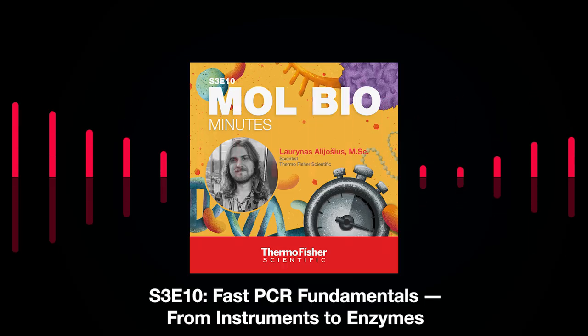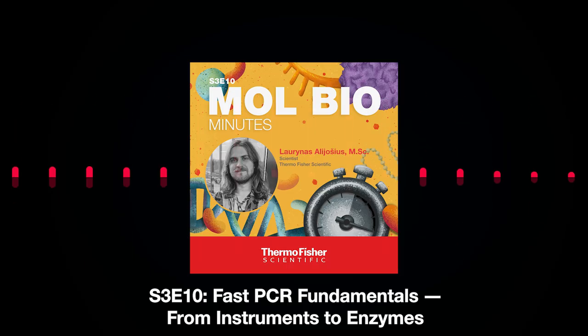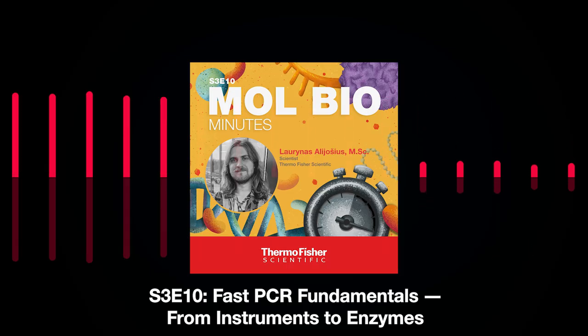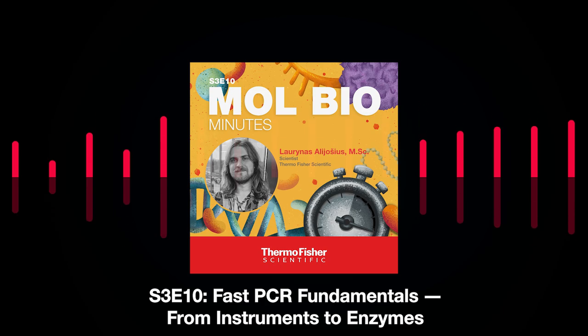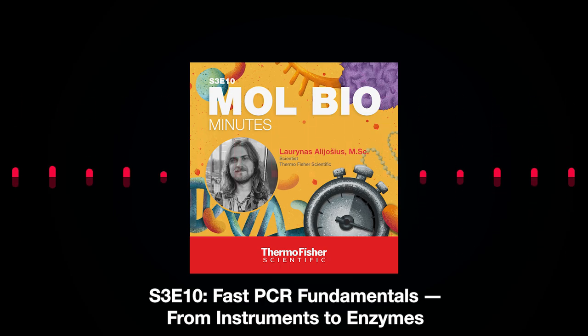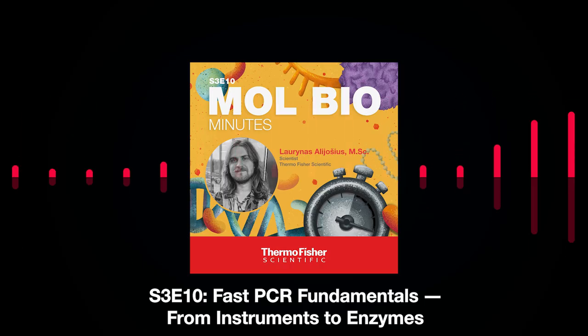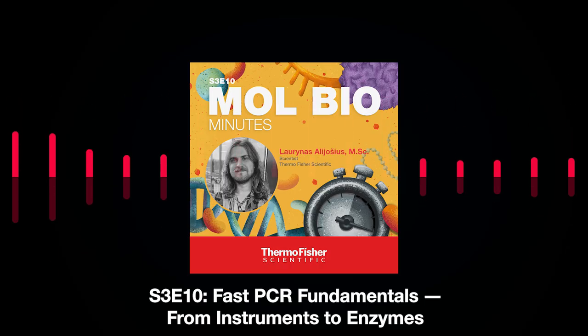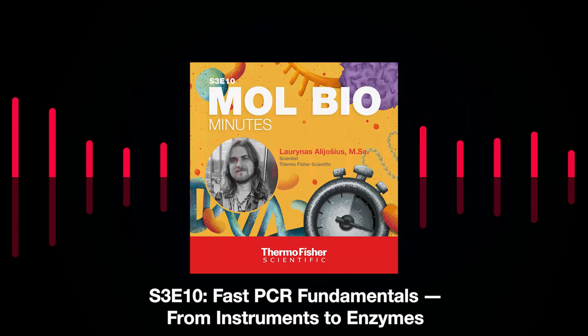So what is it? Let's say a standard PCR usually can take like 2 hours or even more. And when we talk about fast PCR, it can be done in less than 20 minutes even. It can be done very quickly. You're just having a cup of coffee in the meantime and wham, it's done already. This fast PCR saves time and that can also help you to streamline your work in the lab more efficiently.